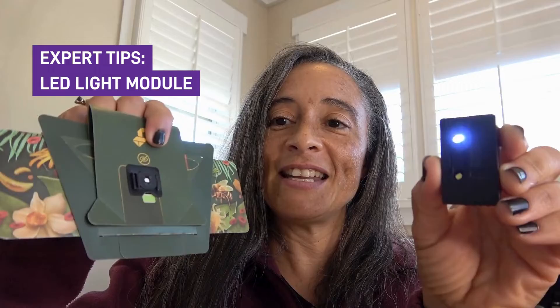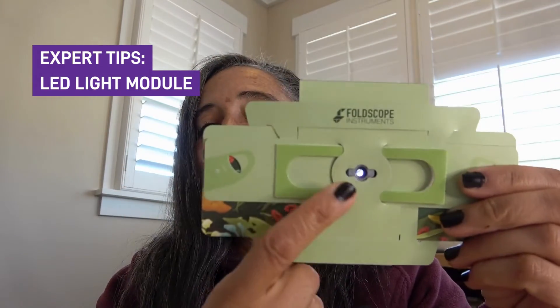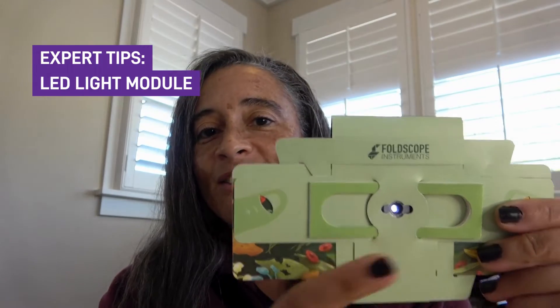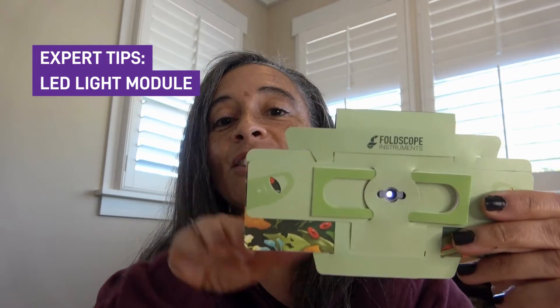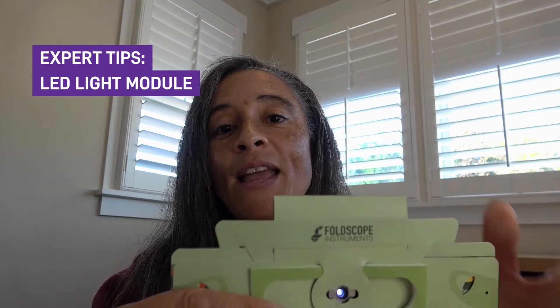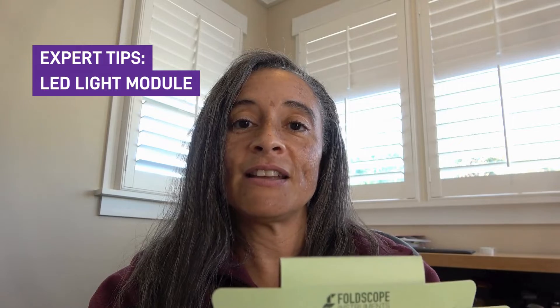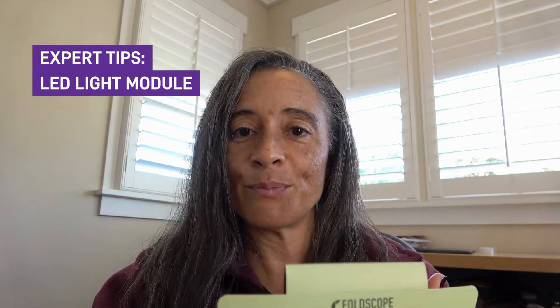So you turn on your LED light and attach it to your Foldscope — I did take off the lens so that you can see a little bit easier the light passing through. You can see that the light would be able to pass directly through your sample. This produces a white or bright background compared to a darker specimen. The sample that you're looking at will actually block some of the light and look darker compared to the background. This is why it's called bright field — because the field in the background is bright.